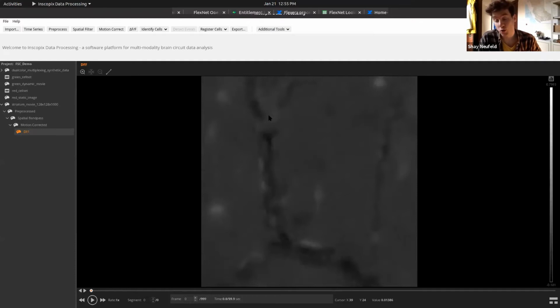We control the optics, so we should be able to automate it. That's going to have to be a cross-team effort with IDAS to get that feature off the ground. Even if we do that, it's still going to be nice to have the feature Shauna recommended if people are already doing that in ImageJ. Yes, and there are a lot of people who don't use the integrated lenses, so we'll still technically need the one Shauna's talking about, because we don't fully control what might.